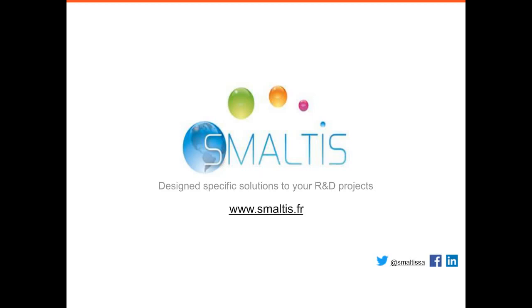And this next one is for you too. Have you also compared signal normalization with confluence to signal normalization with protein quantification? Yes, we compared the confluence normalization to normalization done with protein quantification, and we used the BCA assay for this. So we have that data, but not published in an application note. We can provide it certainly to our customers.